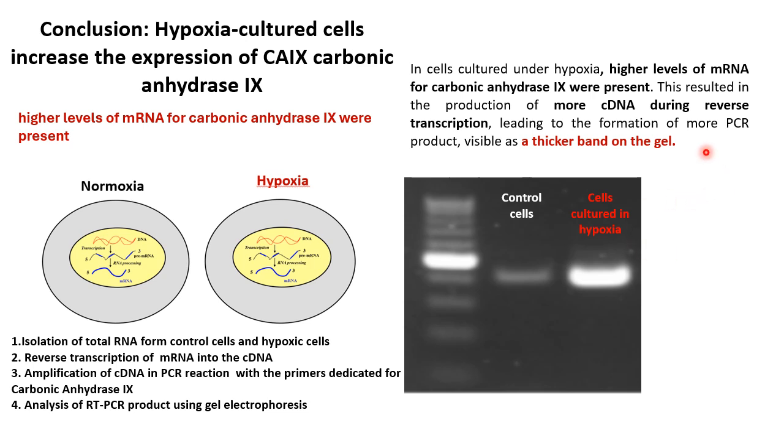If we have more PCR product obtained in PCR reaction, we can see a thicker band on the gel as presented in our example.